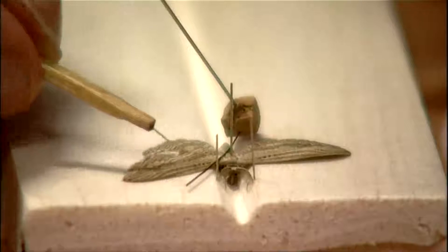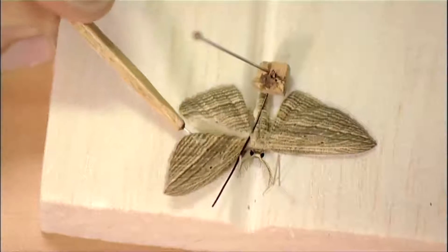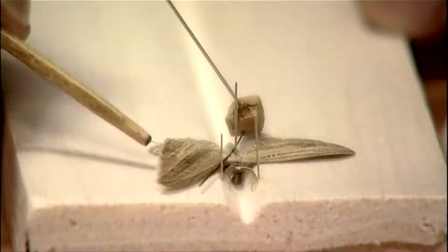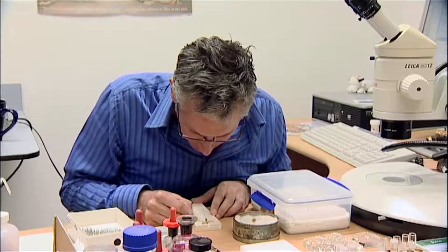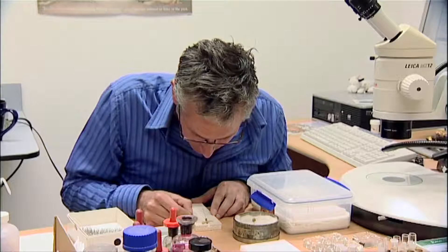Now that the wing is braced at the bottom, we can use this little needle. We put that underneath the wing and we just gently ease the wing forward until the hind edge of the forewing is at 90 degrees to the body of the moth.